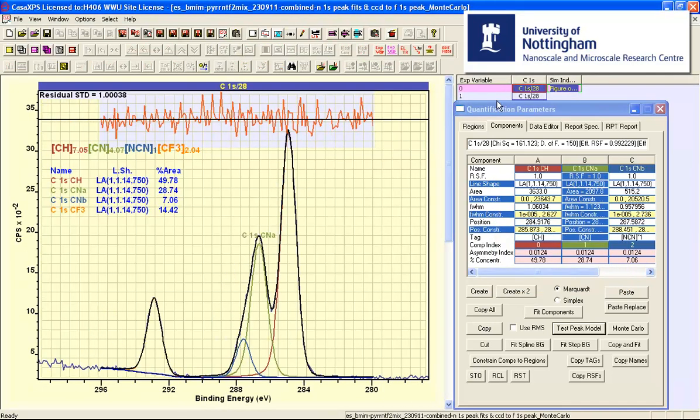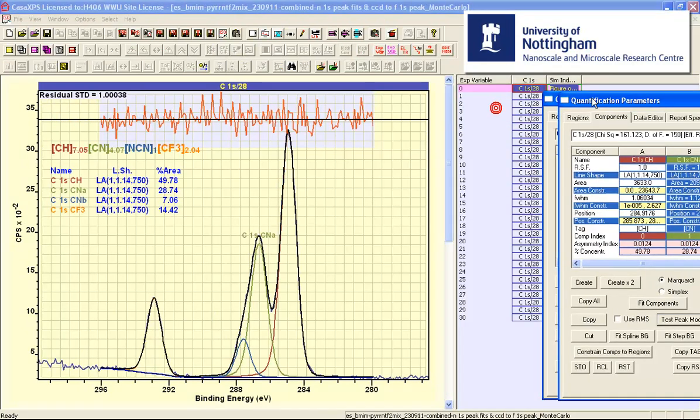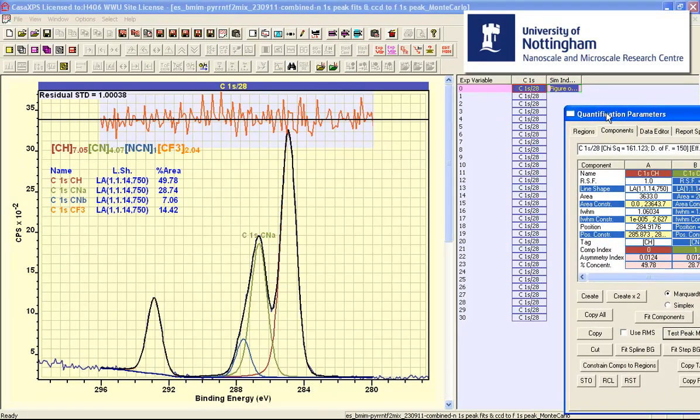The result of this Monte Carlo simulation is a new file that contains a list of VAMAS blocks that represent simulated data and the peak model has been fitted to these simulated data.